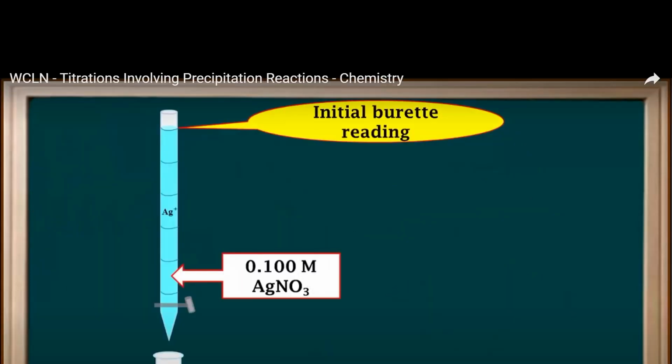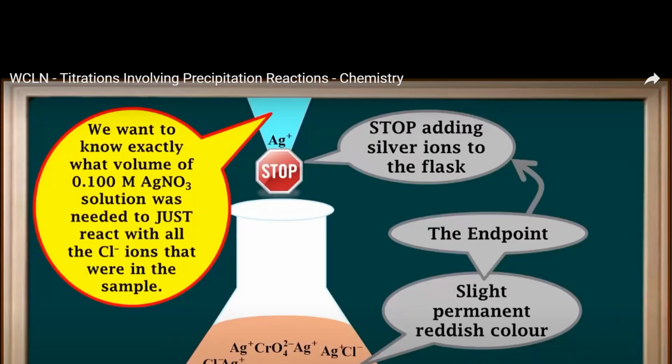Whoops, come back. There we go. So you don't want to keep going once you get to the end point. So that's when we were doing our titration, that would be like the light pink color.